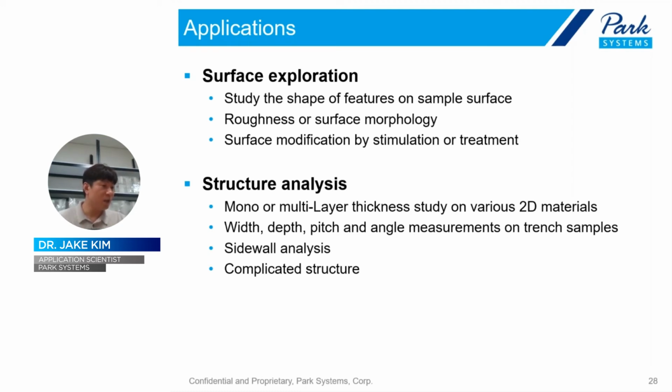Also, AFM is a scanning technique, so we can measure quite accurate numbers like width, depth, height, pitch, angle, and others. And on the next slide, let me show you some examples of AFM application, and I hope it helps you understand how to utilize AFM for your research, for your samples.